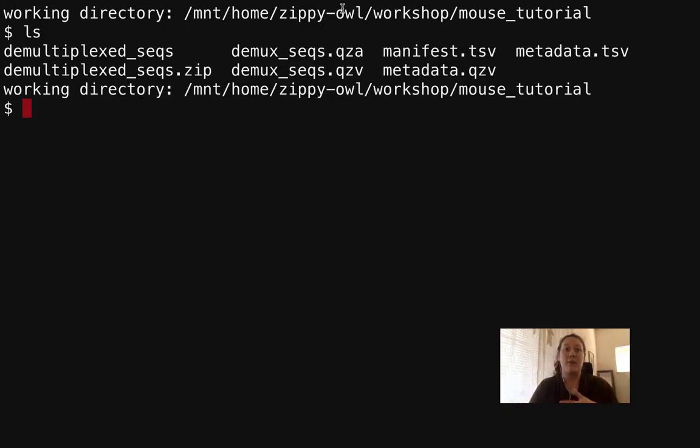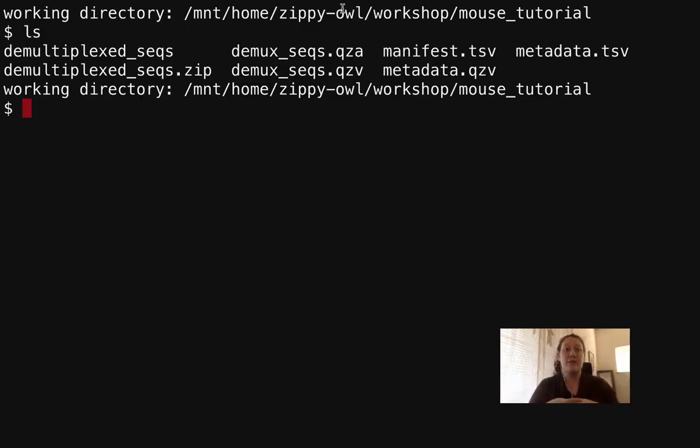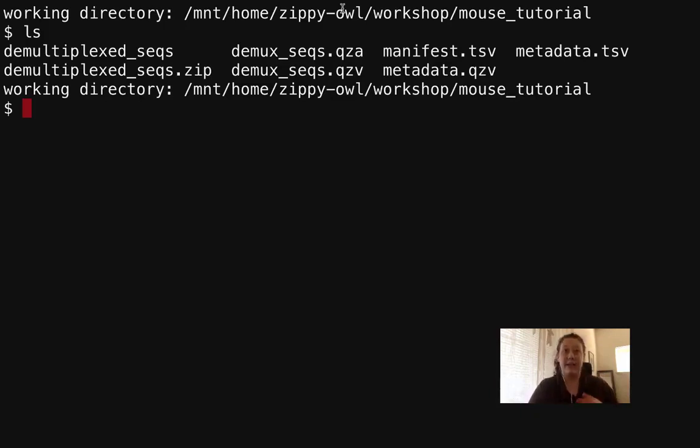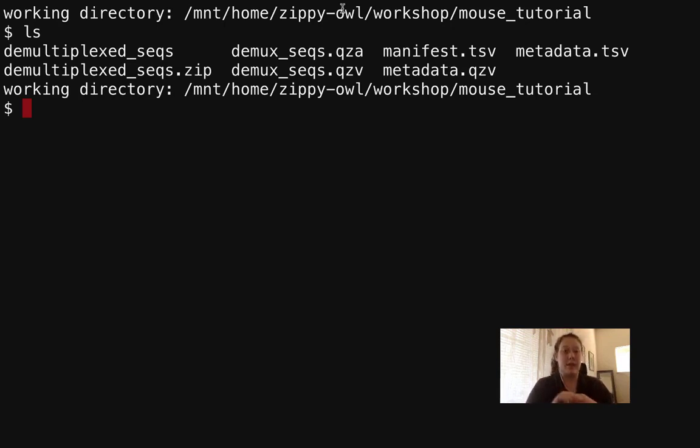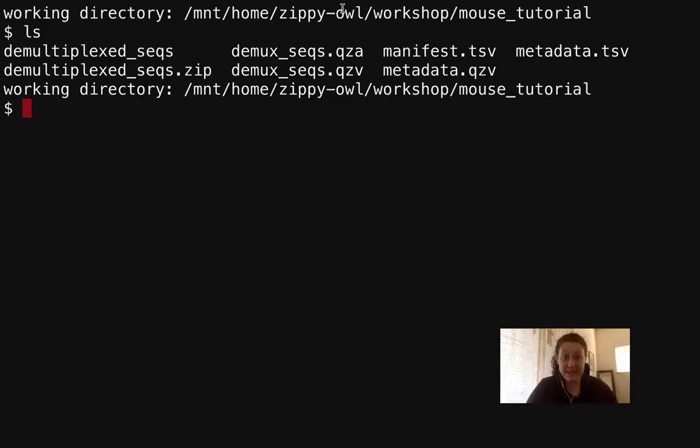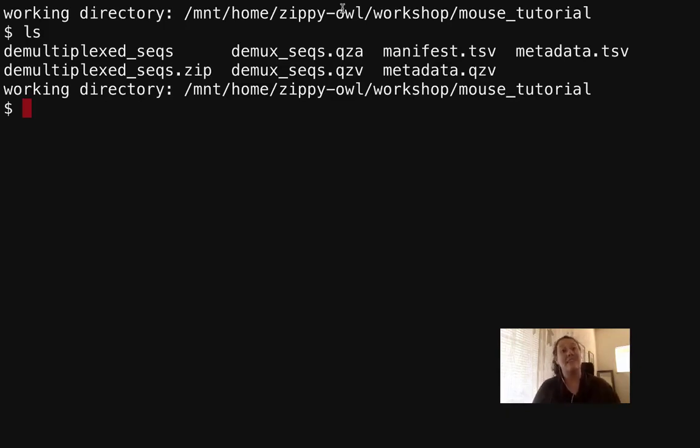In this section of the tutorial we will look at where it's appropriate to truncate our data, how to denoise our data, and how to interpret a DADA2 stats.qzv file. At the end of this tutorial we should have good quality data that doesn't have too much noise that allows us to move forward with the QIIME 2 pipeline.